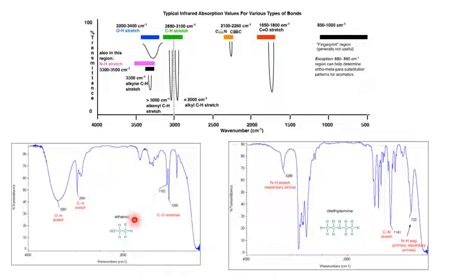This is the ethanol molecule, where you will find an interesting band over here. This broad band around 3300 centimeter inverse is for the ethanolic OH functional group. I have already talked about the OH functional group position, and this band is very broad in nature, due to the fact that these ethanol molecules are hydrogen bonded with each other, and also with some water molecules. And this band around 2961 centimeter inverse is for the sp3 CH stretching frequency. Similarly, there is another band around 1055. It is for this carbon oxygen single bond stretching frequency.